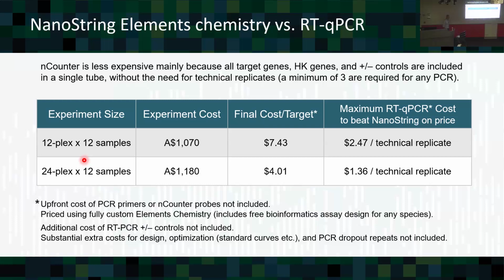Do you know, the thing is, I agree with you. The way NanoString have set this up is interesting. The only reason they built the elements chemistry originally was because people were asking them to build diagnostic assays. But if they did, they'd be providing all the analytes, right? And so the onus of performance falls back on NanoString every time. And the FDA wouldn't... This just becomes a mess, right? Yeah, I think the locked nucleic acid chemistry and technology is now actually locked by Roche.